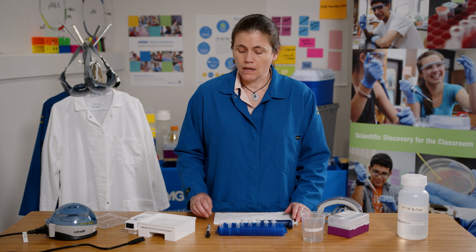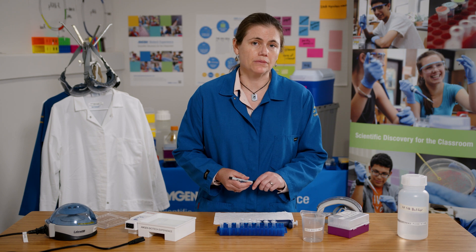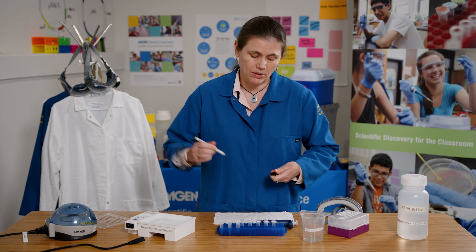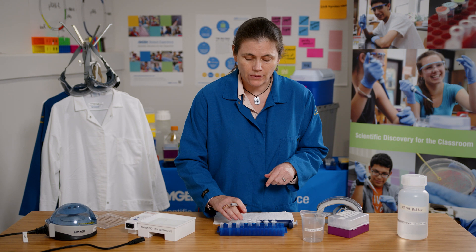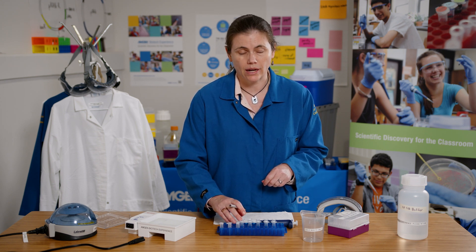Before I begin I need to label each of the sample tubes. I'm going to label them with GE for gel electrophoresis, so I'm going to have GEK-, GEK+, GEA-, GEA+, and a lig tube. I need to remember that the rest of my lig tube is going to be used in another lab, so I need to save that and not throw it out.